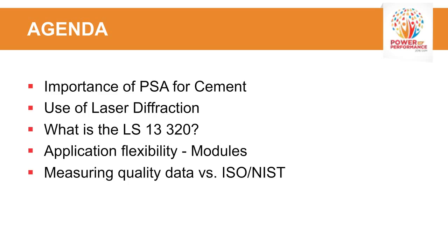We'll be discussing flexibility of modules, that is, how to present samples to the instrumentation, and also quality data, comparing to ISO standards as well as NIST 114 SRM's 114Q for cement.